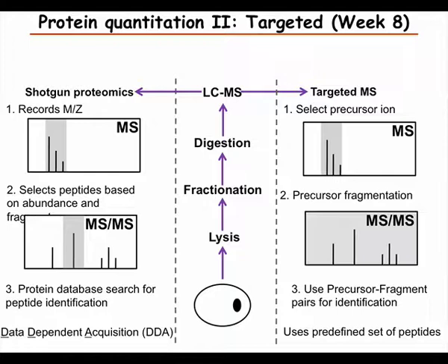Then one can do the experiment in several different ways, but there are two main ways to design a proteomics experiment. Either you can do what's called the shotgun experiment, or a discovery experiment, where you don't make any assumptions, but you try to fragment as much as possible and get as much information as possible to get a survey of what's in your sample.